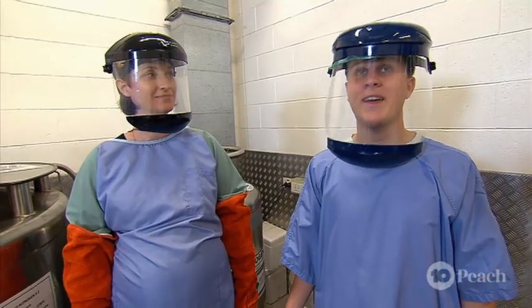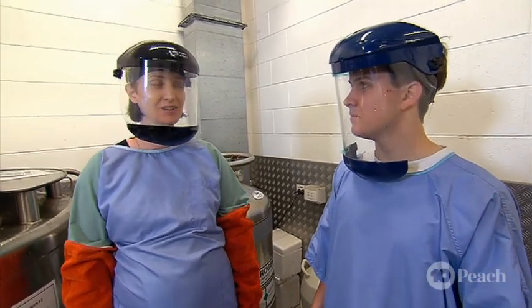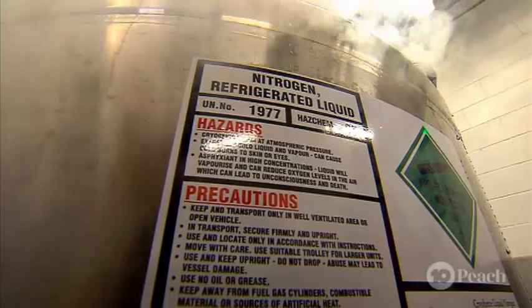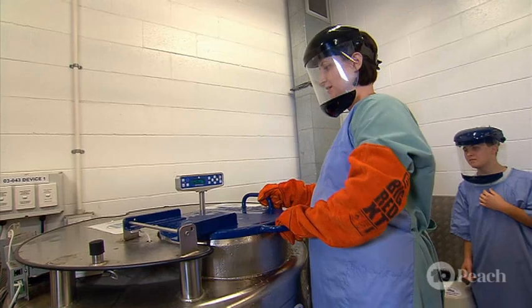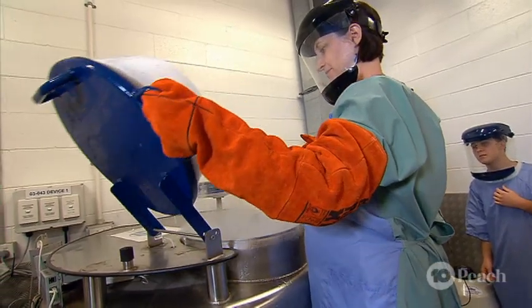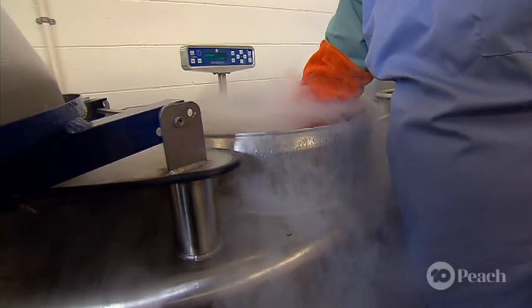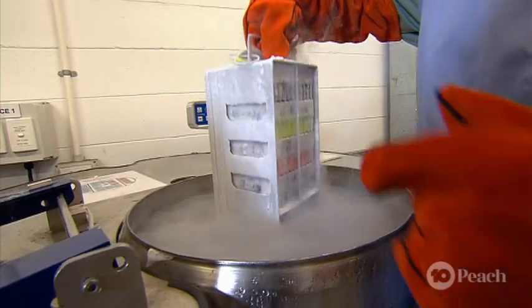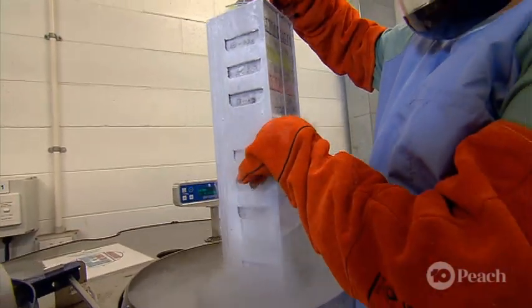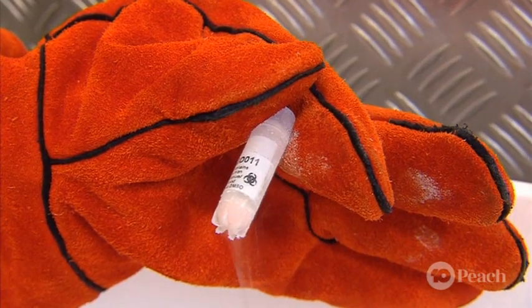And this is the bank itself, the Tumor Bank. That's right, Max. We're the Queensland Children's Tumor Bank, located here at the Queensland Children's Hospital. We store all types of tumours, and that includes liquid tumours such as leukemias, or solid tumours such as brain cancers or skin tumours. And we store them in these large biobanks, which are at minus 176 degrees. That ensures that the tissue is nice and viable for researchers to be able to look at for new drug targets, and also to understand the tumours themselves.